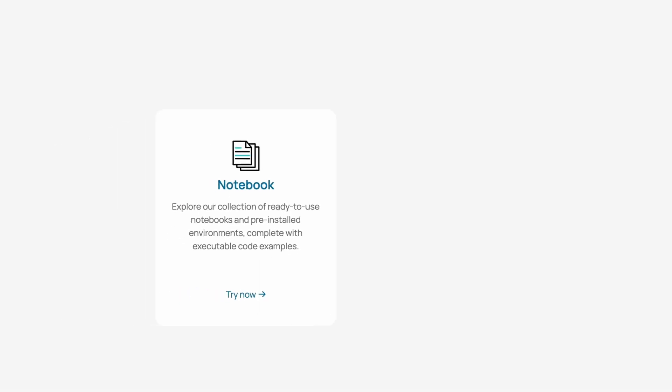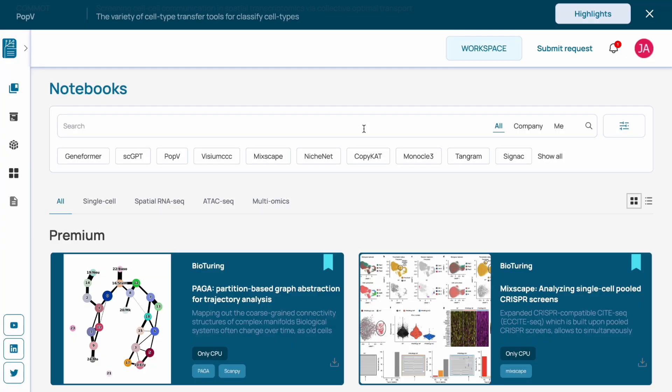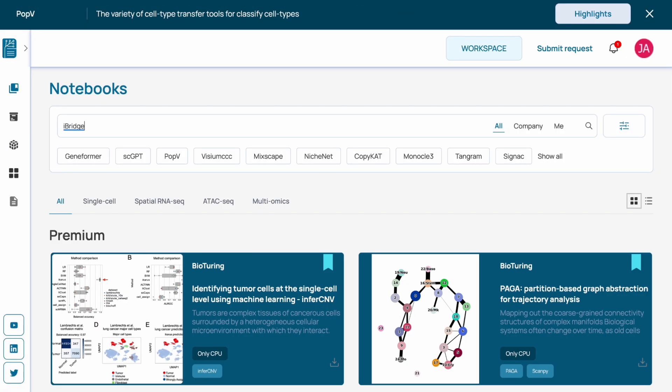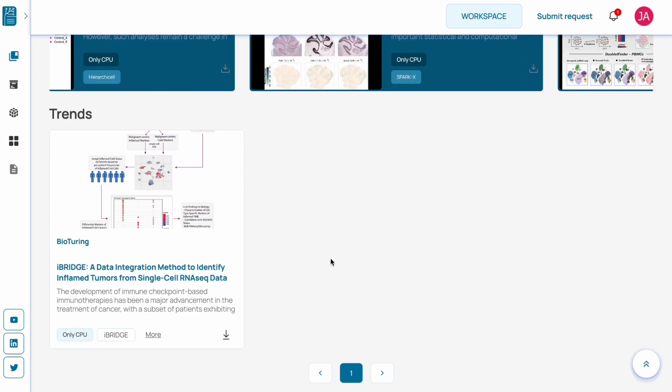Explore the latest multiomics methods with ready-to-use notebooks ranging from cell-cell interaction, spatial cell type deconvolution, ATAC-seq analysis, or trajectory cell state analysis.